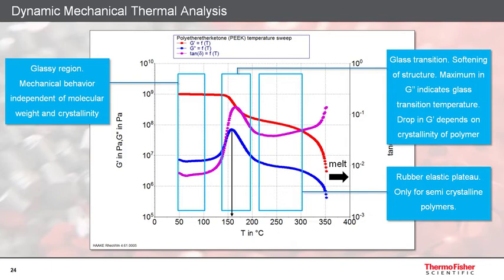Only semicrystalline thermoplastic polymers exhibit a melting temperature. Purely amorphous polymers go only through a glass transition with no further melting point. Besides measuring the phase transition of a polymer, temperature sweep tests are also useful for finding the ideal processing temperature range of a material, as well as for investigating the properties of solid samples, like brittleness, stiffness, or the damping behavior.